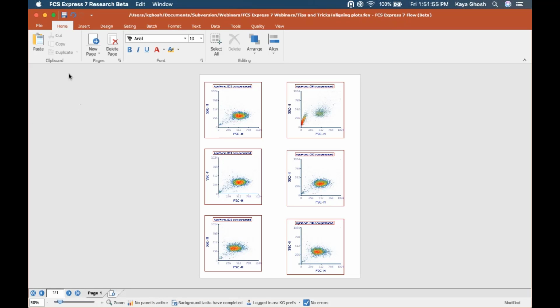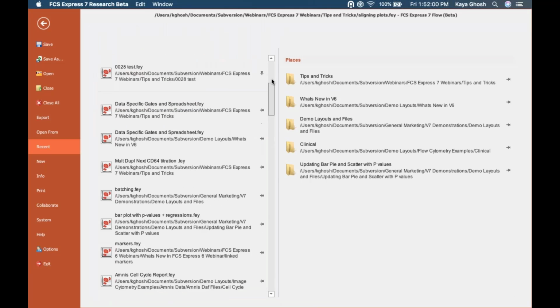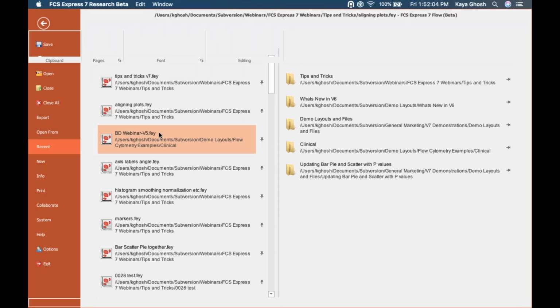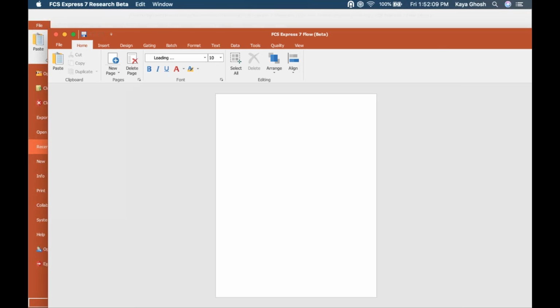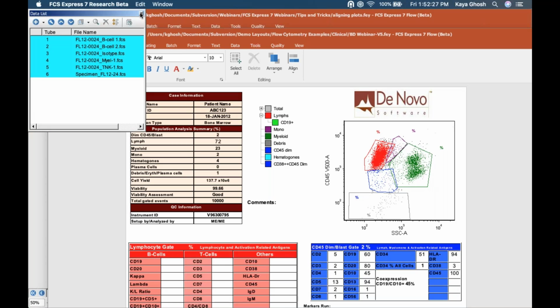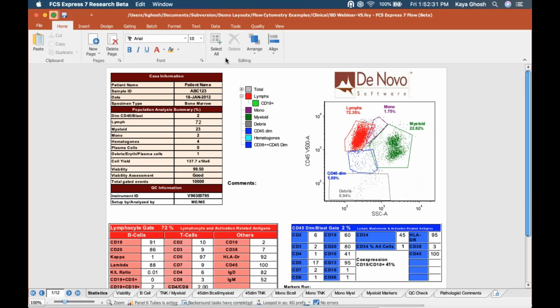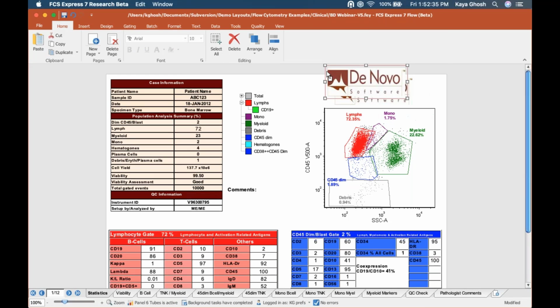Okay, so another thing about layout formatting. So I'm going to open up this layout while I talk. This is a very large layout I'm about to open up, which is why I closed it before. So let's say you're doing an analysis and you want the results to look fairly professional or just nicely designed. Maybe it's a layout you're going to use often or a layout that you're creating for clients or collaborators, and you would just like it to look somewhat professional. So this one actually already has a logo on it, so I'm just going to delete it for the purposes of illustration.